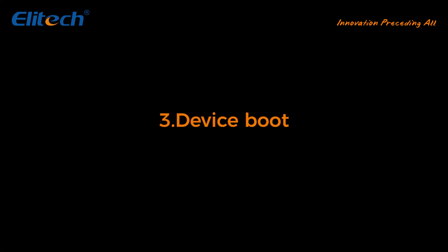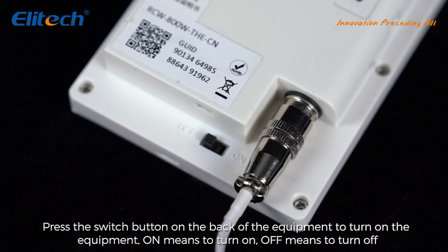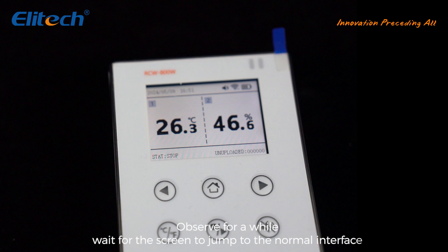Device boot: the device is powered on by pressing the switch button on the back of the equipment. ON means to turn on, OFF means to turn off. Wait for a while for the screen to jump to the normal interface.